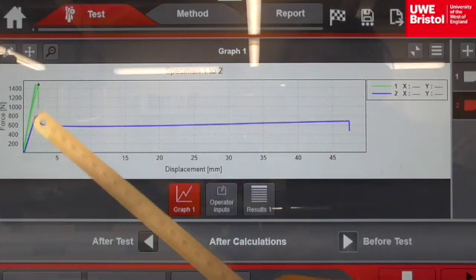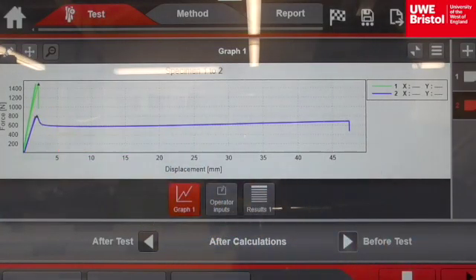Looking at the plot for the polystyrenes, the first plot in green is the unmodified polystyrene. And the second plot in blue is high impact polystyrene. High impact polystyrene has an additive mixed into it, which is butadiene, and that gives it different properties between the two polystyrenes. The distribution of butadiene into the polystyrene is referred to as a polymer blend.